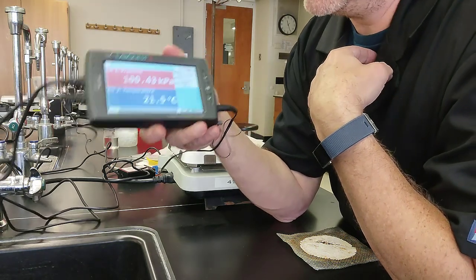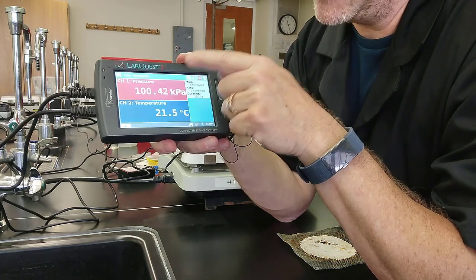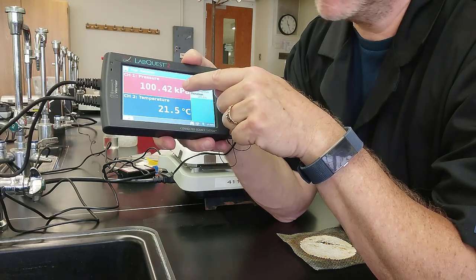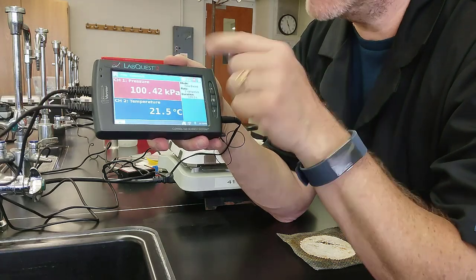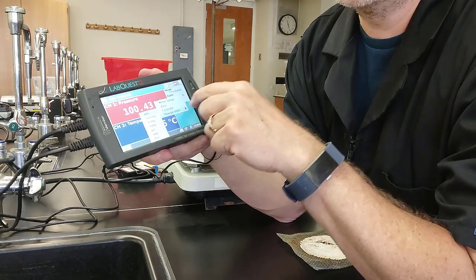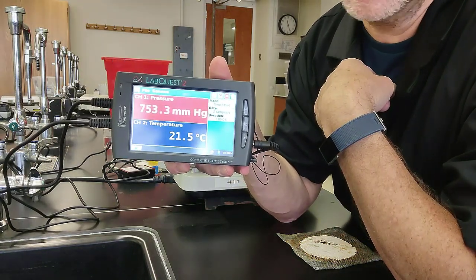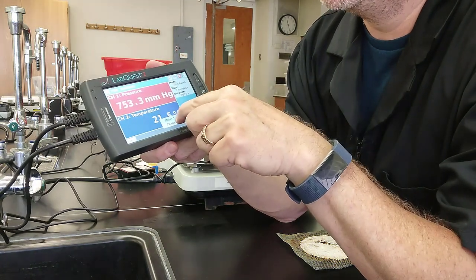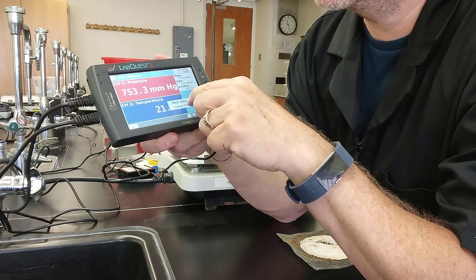Now, interesting point. Changing from kilopascals to millimeters of mercury or atmospheres or torr is just a multiplication or a division. And since our equation is a multiplication and a division, we would be multiplying this kPa by the same thing on both sides. So we don't technically have to do it, but I can change it by clicking on change units, and we'll go to millimeters of mercury because that's what's most common for us when we are discussing this in class. Now, I could change this to Kelvin if I wanted to, but again, there's not really a reason to do so.